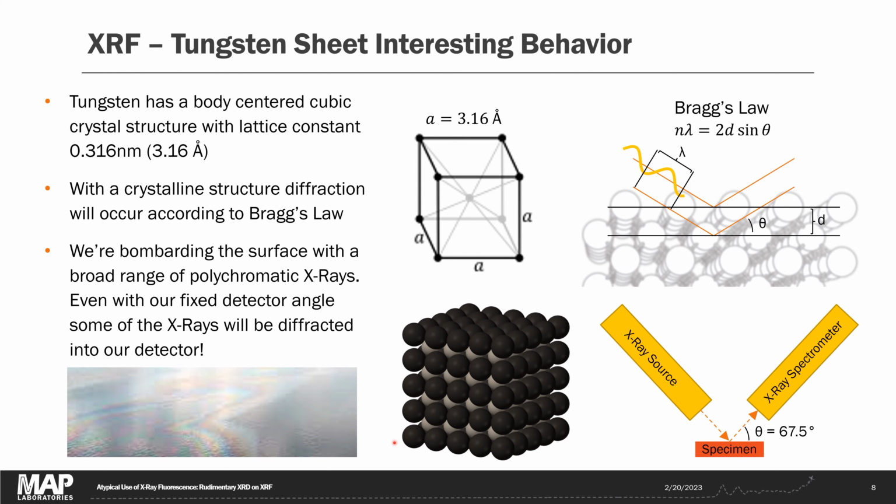One of the sampling artifacts you learn about when doing XRF analysis is X-ray diffraction. X-ray diffraction occurs when you're analyzing crystalline materials, and certain frequencies of X-rays are reflected back from the surface in a way that interferes constructively, causing you to receive a peak at a particular energy. This is similar to the effect that occurs when you have a thin film of oil on water, and at different angles, different frequencies of light interfere constructively, generating a rainbow effect.